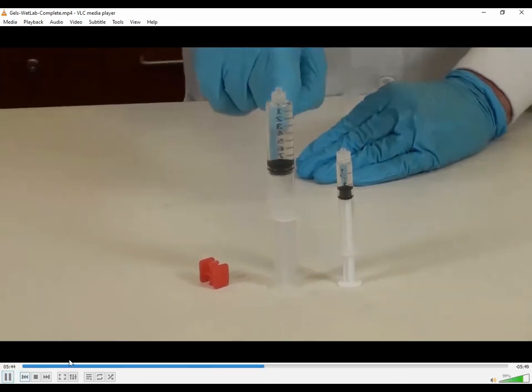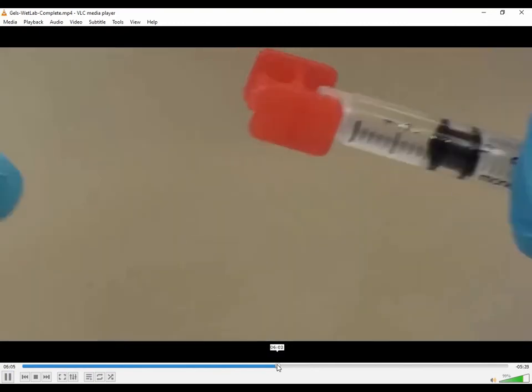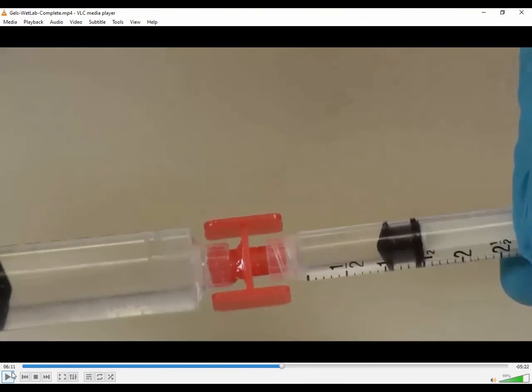Our Poloxamer solution, and this is the aqueous phase. We want to go ahead and squeeze it off, and then attach our 3 ml and luer lock that on. Okay, so we have twisted and connected the 3 ml syringe to the 10 milliliter Poloxamer containing syringe.